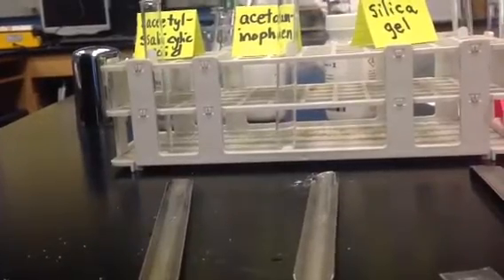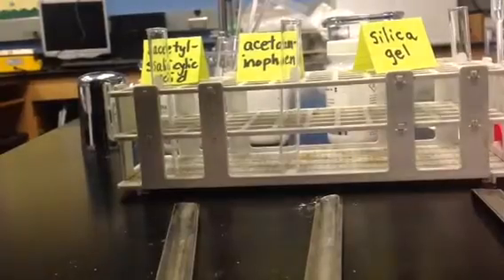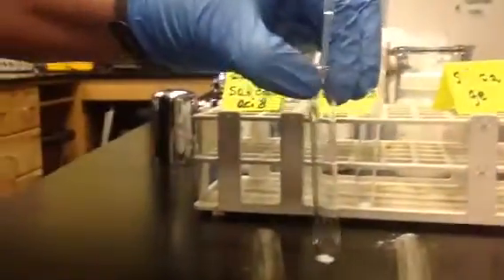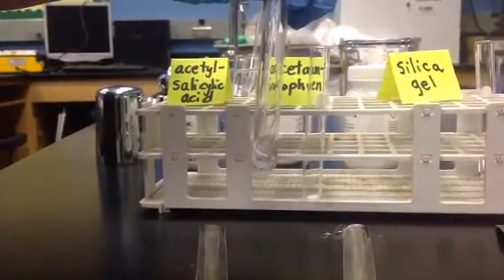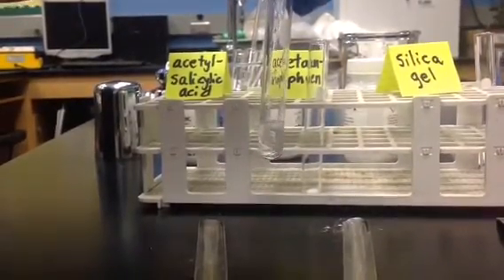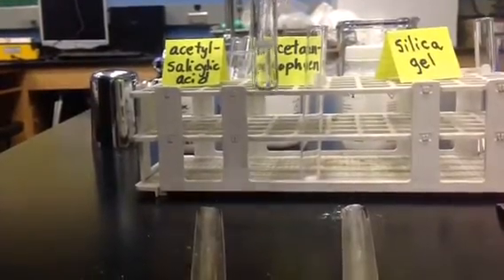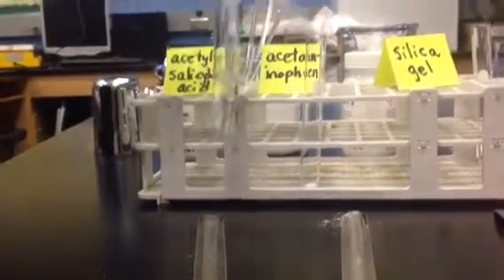And we're first going to add the sodium bicarbonate, which is a base. So I'm going to add a base to this and see if I can get it to dissolve. I added 1 milliliter of sodium bicarbonate.